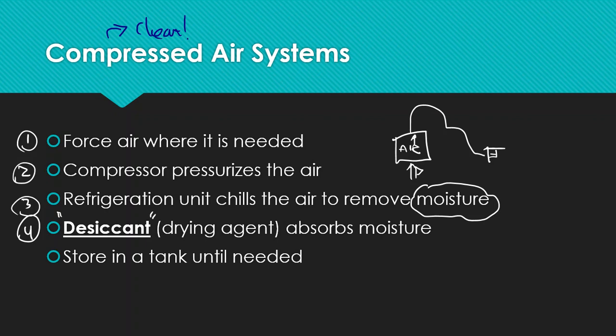I can't. All right, so desiccant is this idea that this is something material-wise that will also help absorb moisture. So if you're already looking at a trend here, you're seeing that water is not our friend in some cases, nor will it ever be. So here is another backup that we can use in the laboratory setting or in the manufacturing line that does a particular purpose, and that's absorbing moisture.